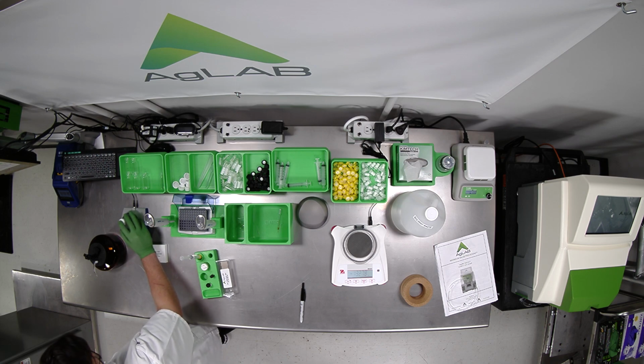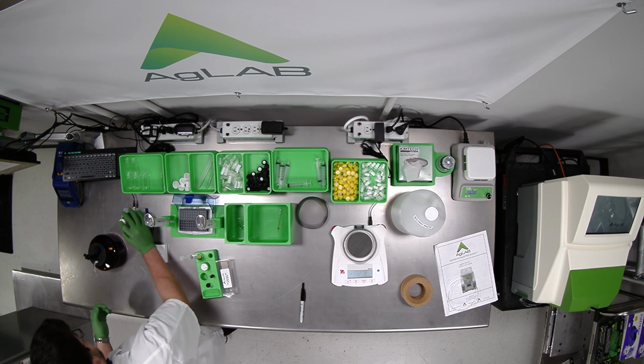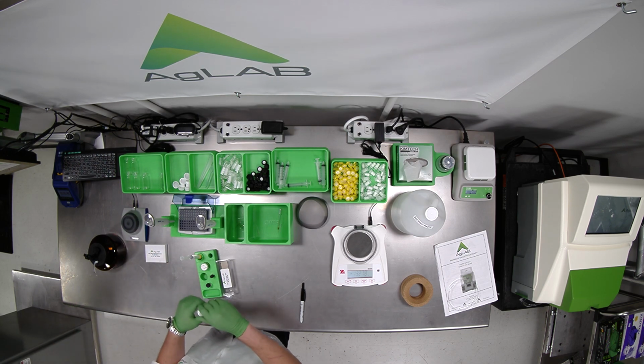So we've altered the scale of this sample preparation so that any tiny mistake isn't going to ruin your ending results. There is a little bit of room for extra drops or missed drops, so there's no need to throw away your sample if you don't make a perfect transfer with, let's say, your methanol. But definitely keep an eye on it and try to stay as precise as you can.